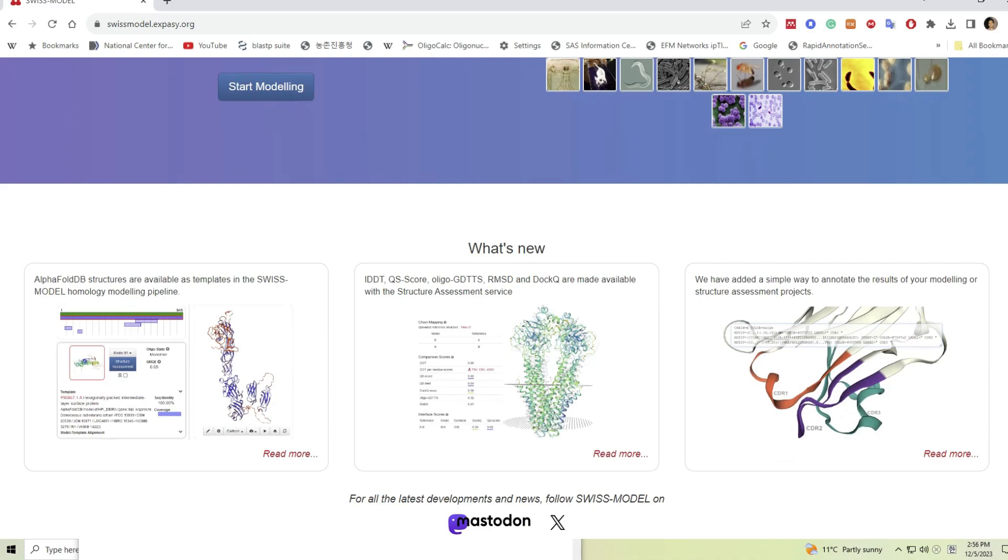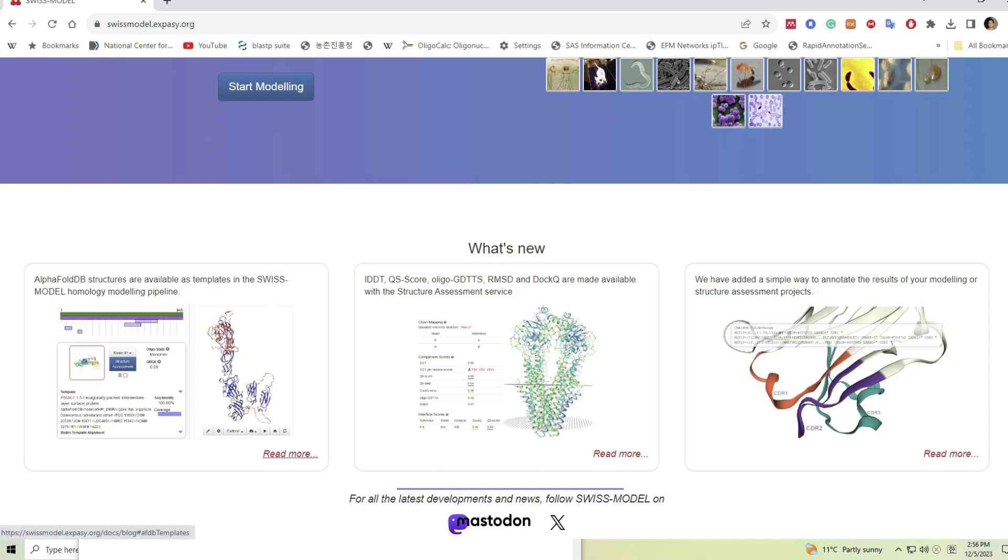In the lower section you can see new incorporations into SWISS-MODEL, such as incorporation of AlphaFold database into the search results, advanced structural assessment services, and model annotation facilities. All are very useful when constructing a protein model.